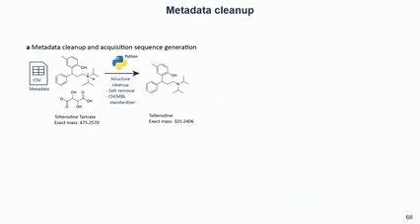So I said we have 3 different steps, and the first thing that we found out is that you need to have clean metadata, so it means you need to have the compound name. But if you get compound libraries from a vendor, they provide you with different salts in the structure that they used. So in this case, for example, we have a tartrate, but we will not see this salt obviously in MSMS or in MS in general. So we need to remove it to in the end get the monoisotopic mass of this neutral molecule.